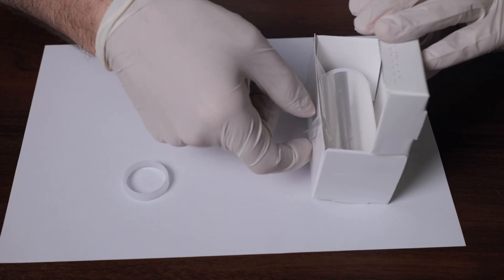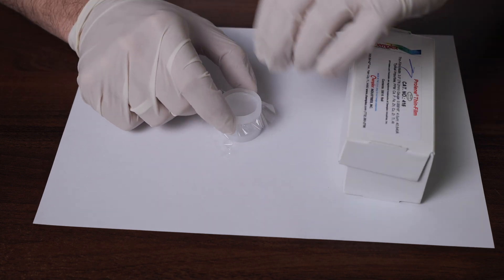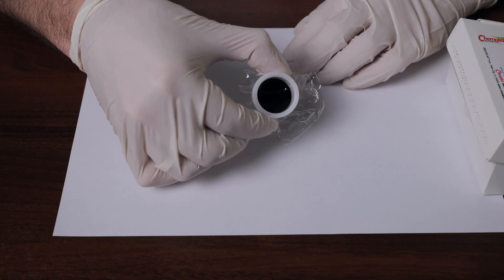The second step is selecting the correct film. Polypropylene film is used for acidic and alkaline solutions, while polyester film is used for petroleum products. It is important to check the film for impurities, as polyester film may contain contaminations that could interfere with the analysis. The third step is stretching the film tightly over the sample cup ensuring it doesn't sag, then pouring the liquid into the cup. Once done, the sample is ready for measurement.